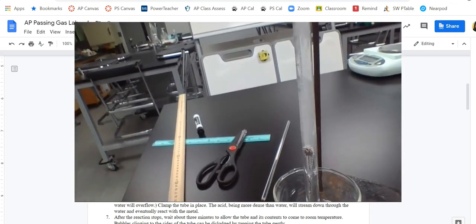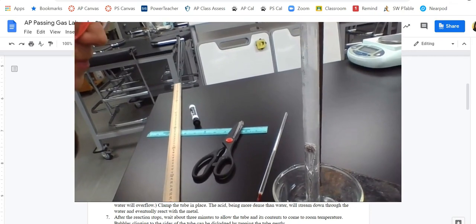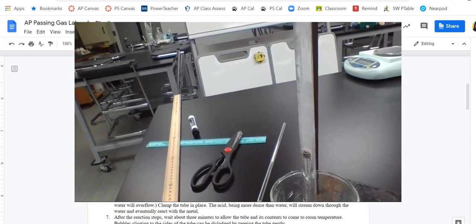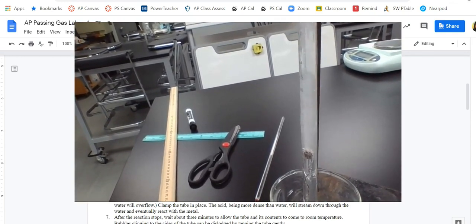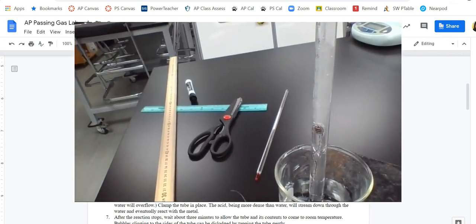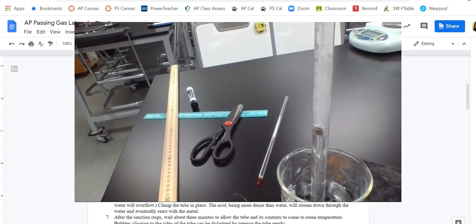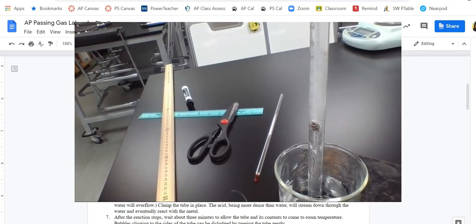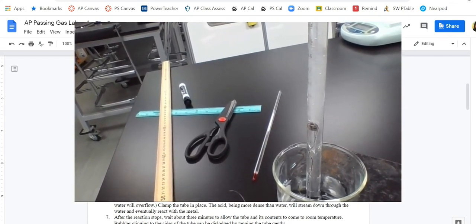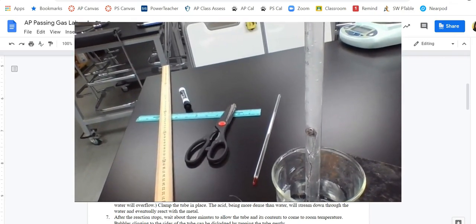Okay, sounds. As far as your qualitative observations go, I'm hearing fizzing. Now, normally if there were class, you wouldn't be able to hear this because there would be so many people chit-chatting in the class, but there's definitely some fizzing going on, okay? So I can see lots of fizzing. This is happening really quickly now. There it is happening, okay? And so that 3.10 centimeter piece of magnesium, let's see what ends up happening with this reaction.